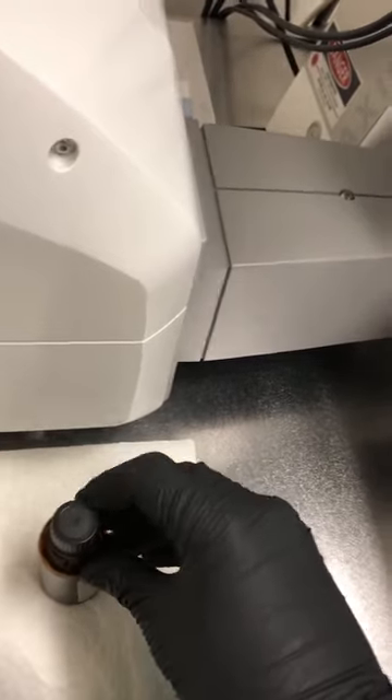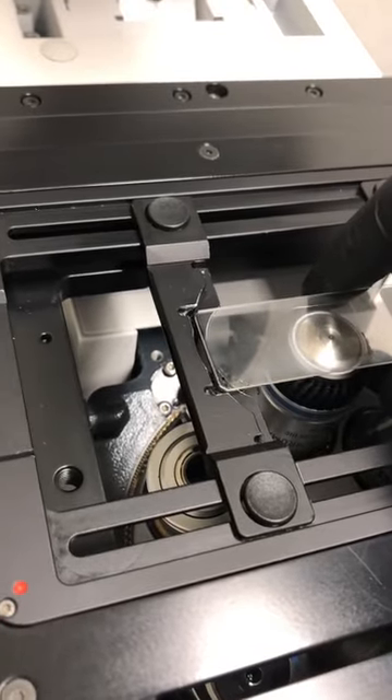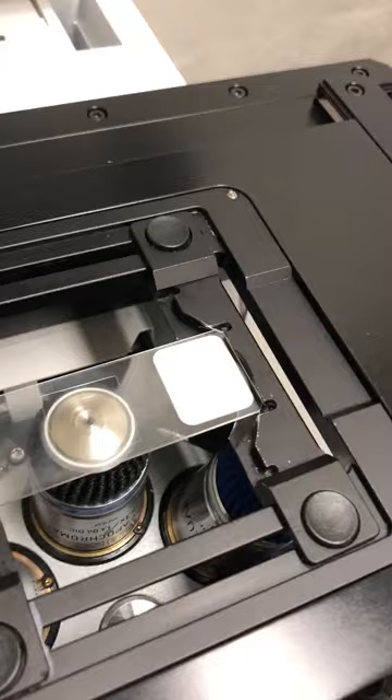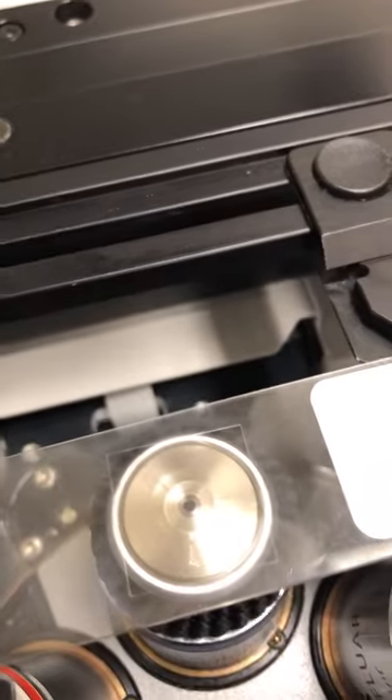I'm going to close that, and then I'm going to put this sample again - the cover slip towards the objective. Then I'm going to hit this done button here, and that will bring the objective up until it touches the sample or almost touches the sample.